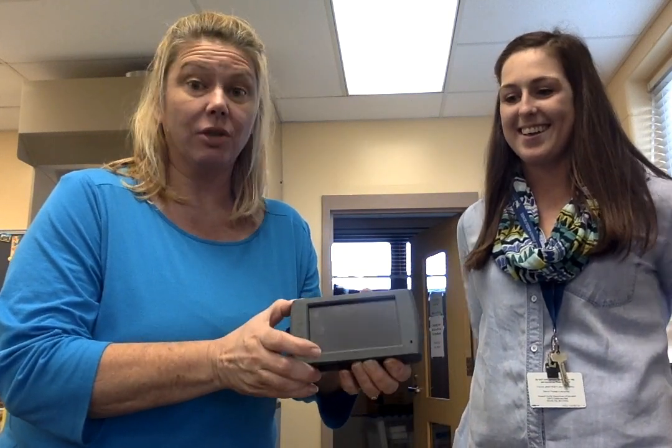Hi, Ms. Hines and Ms. Almer. We're here to show you how to use a LabQuest Vernier science tool.